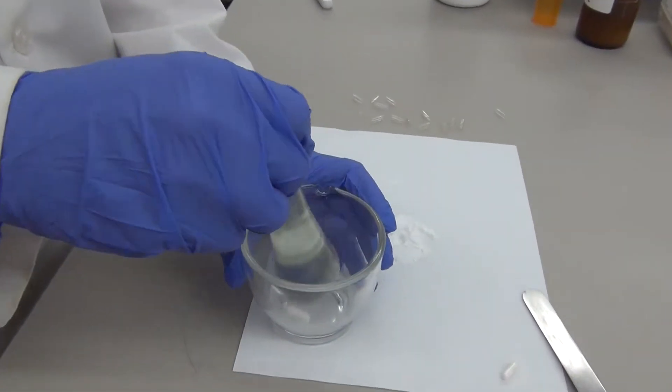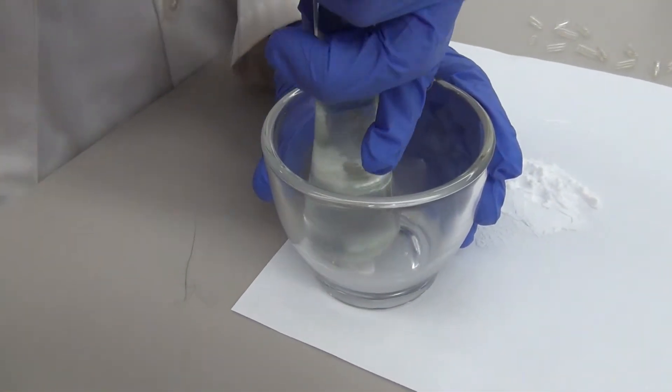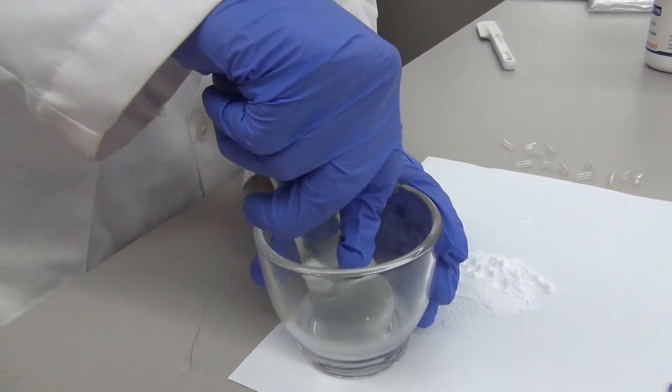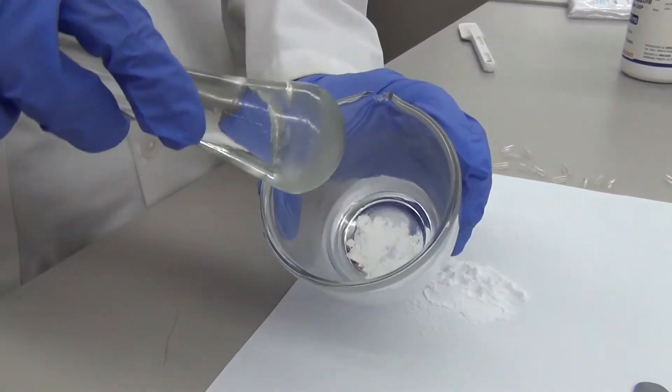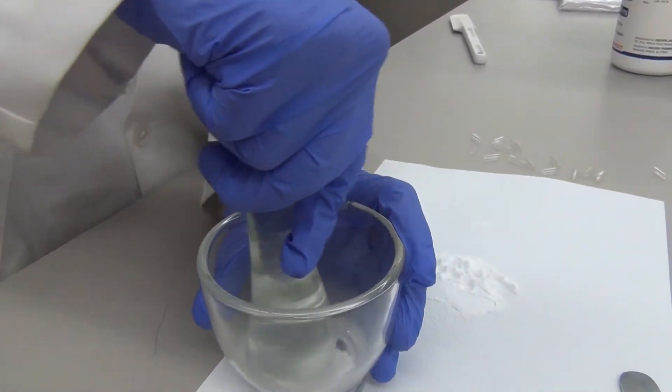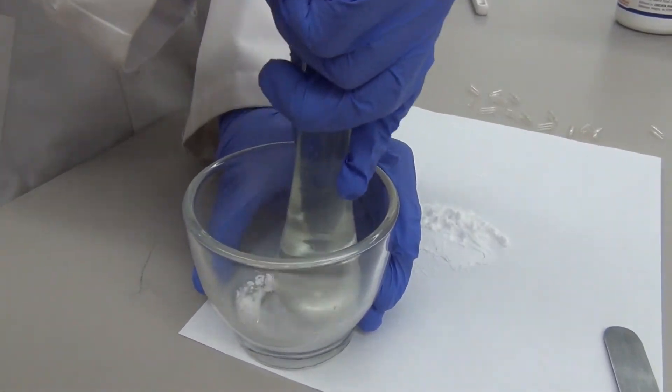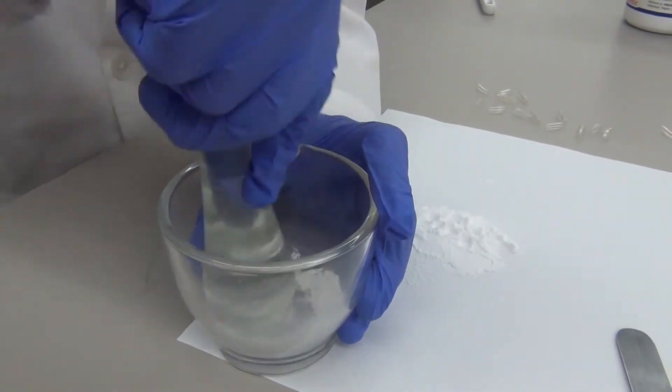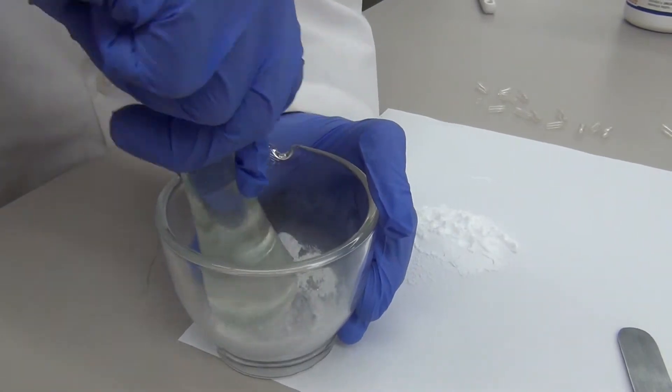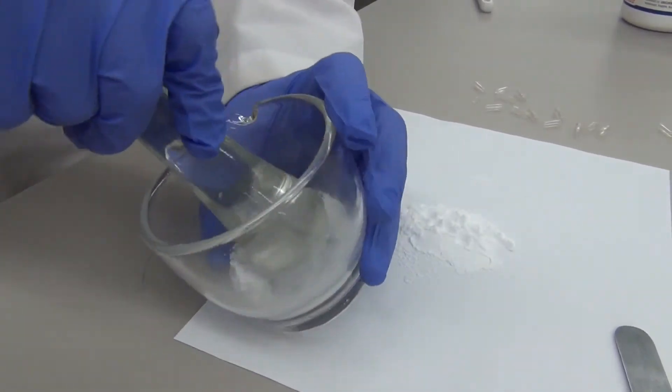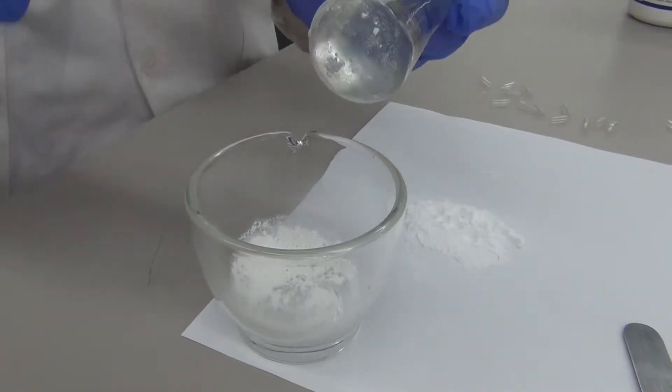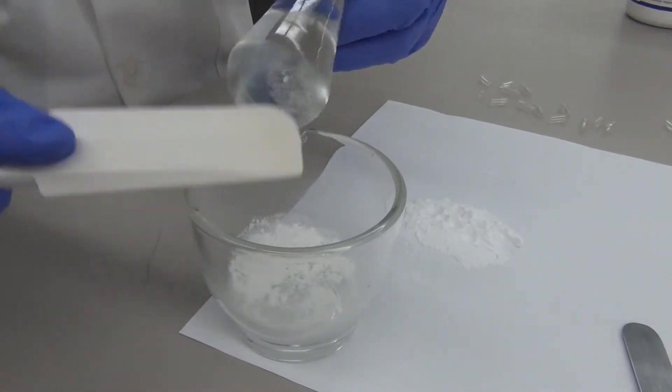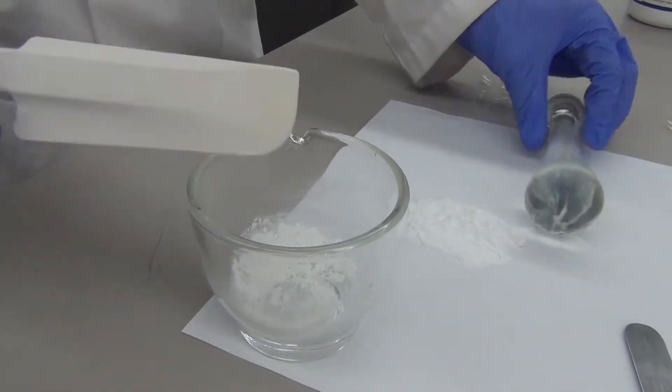Crush the drug using the glass mortar and pestle. Try to grind the tablets rather than smash them. If you use too much force bringing the pestle down onto the mortar, you may accidentally crack the mortar. Use a rubber spatula to try and gather all of the drug together. Never use a metal spatula in contact with a glass mortar.